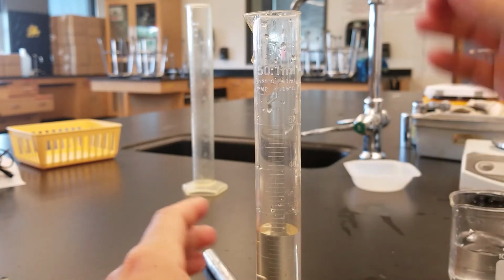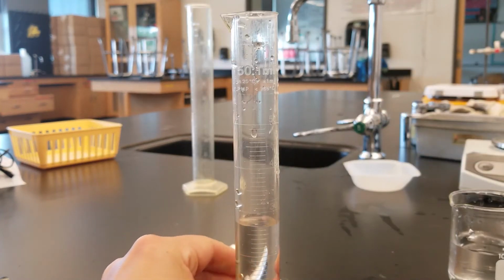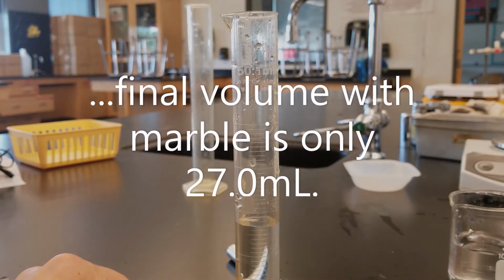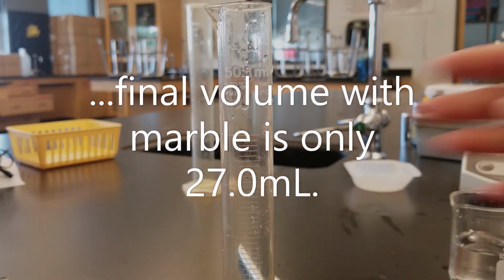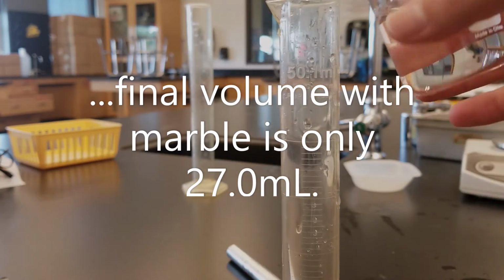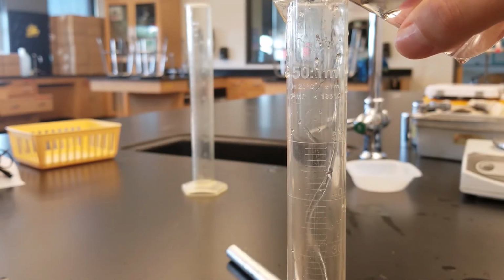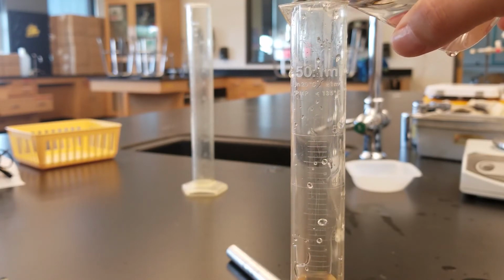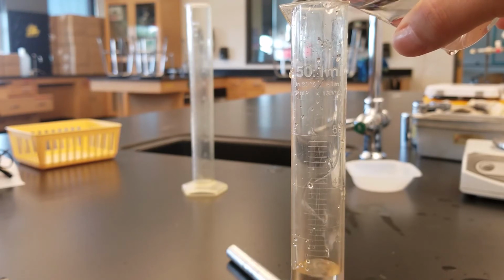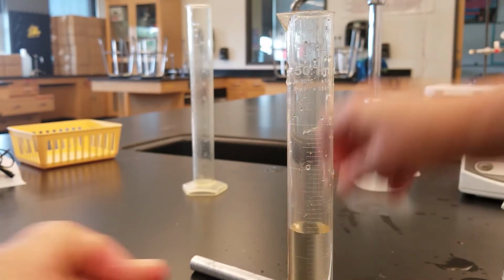Object number 3 is the marble. Object 4, the penny.